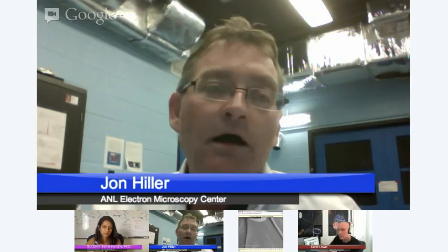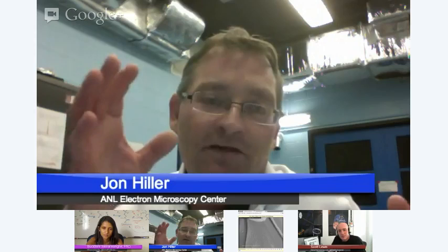And so what we decided to do is pretend your sample is a loaf of bread that isn't cut. Okay. And we basically use the focused ion beam to cut the slices of bread. And so the ion beam would go in and make a cut, and then the scanning electron microscope would take a very high resolution image of it. And then you have an image. Right. The ion beam would get turned back on and make another cut, and then another image. And then you can take all of the stacks of the slices of bread, and using some post-processing software, put together a three-dimensional reconstruction of your sample.